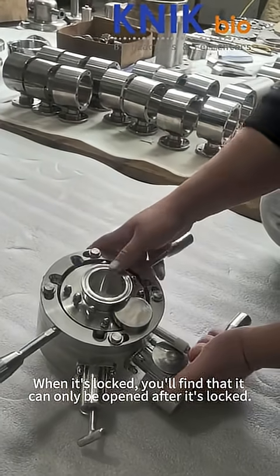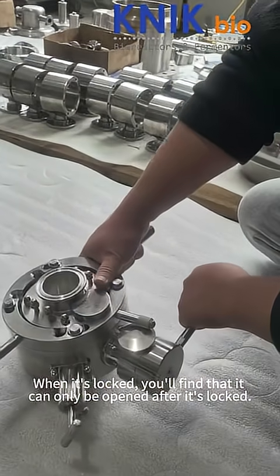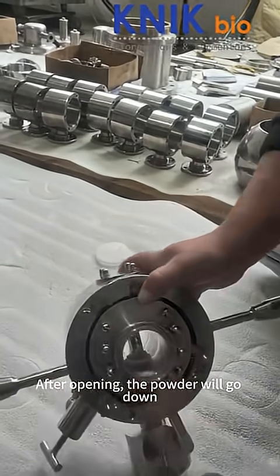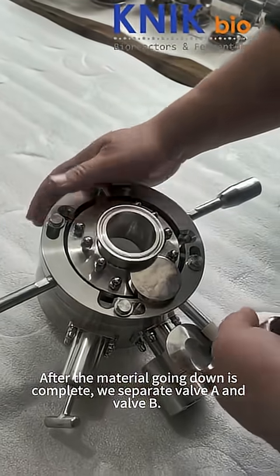When it's locked, you'll find that it can only be opened after it's locked. Manually open it to the correct location. After opening, the powder will go down. After the material going down is complete, we separate valve A and valve B.